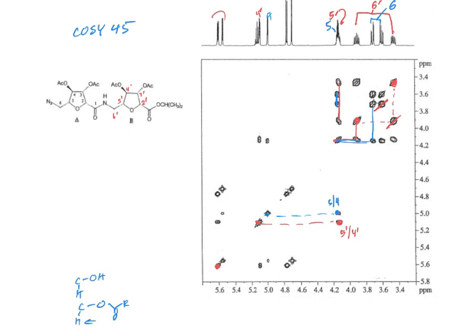All right, so from 4 prime go down to here, to here. This is 3 prime. We go from here, this is 3.